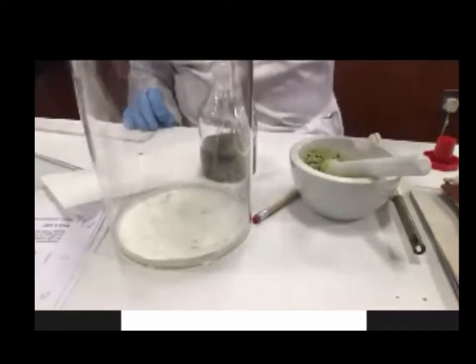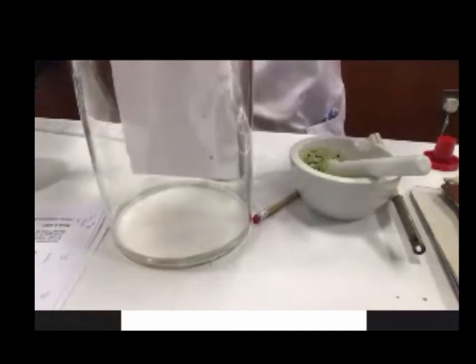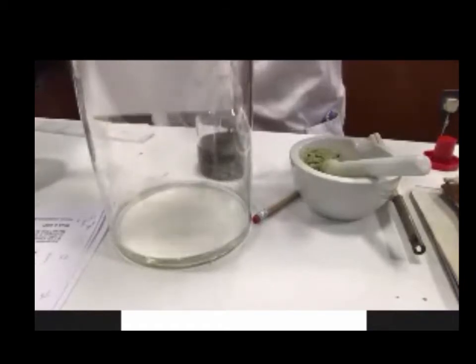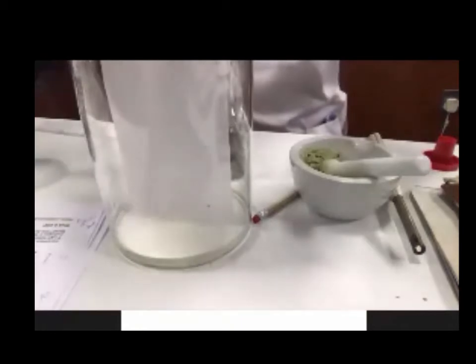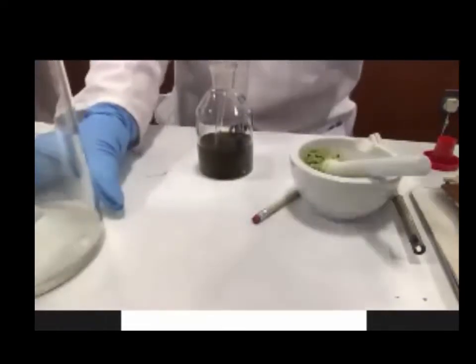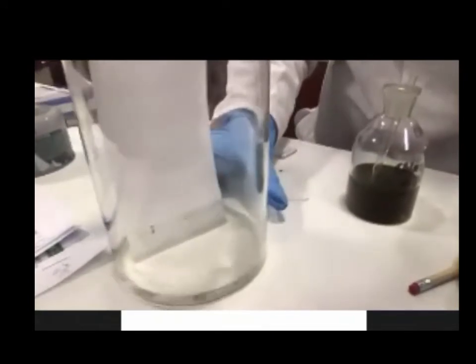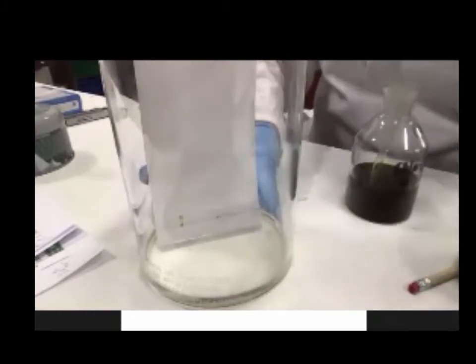So next thing, chromatography jar. We just add our solvent, and we make sure our paper touches it. Okay, there we go. So that's chromatography, and I don't know, can you see, but immediately we can see the pigments on the freshly made one. I didn't have the patience to do the other one.